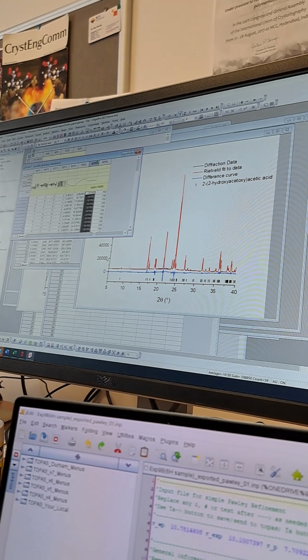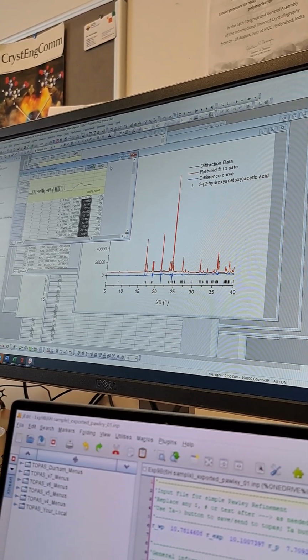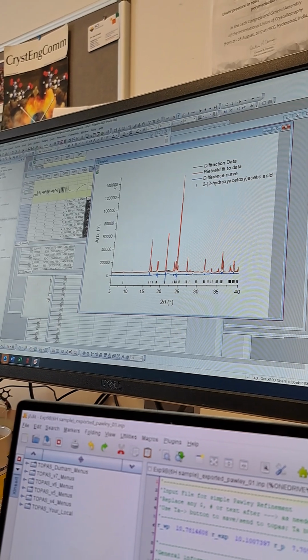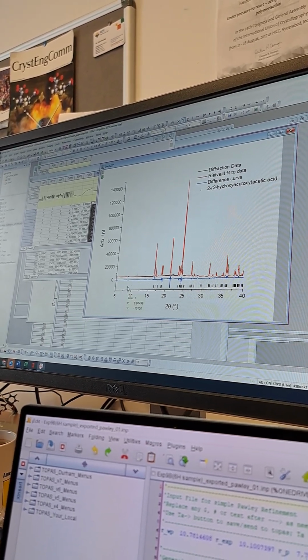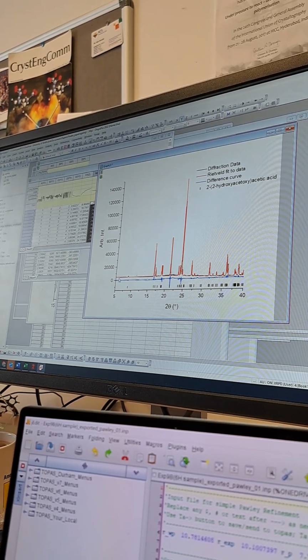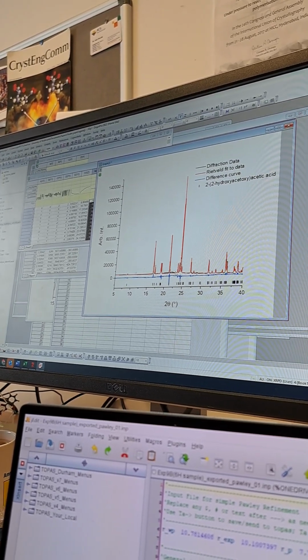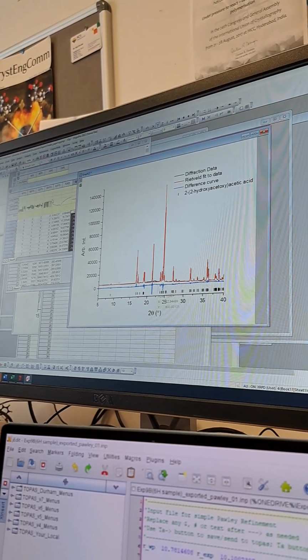It all depends on what your y-axis is here. You might want to change that to be 0, you might want it to be 100, you might be on to 1,000. It all depends on what your diffraction intensity is like. So obviously at 140,000, this value needs to be a lot lower. It could be 0 even, right? You've got your observed data, your model, and your difference curve for each of these.